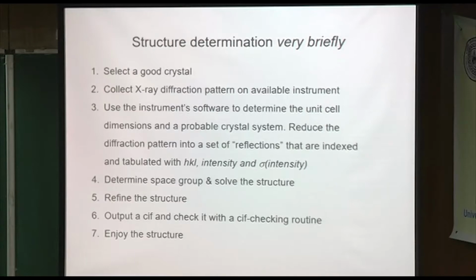And this is where your friendly crystallographer may be a big help to you, especially when you go to check the CIF. Now, checking the CIF also is disappointing in a way, because there's always complaints called alerts about things that you did. Sometimes you can explain them away. And in fact, I think maybe only 1% of the time have I written a CIF, checked it, and had the response, "Congratulations, your CIF is perfect." But I was an editor for Acta Crystallographica for 12 years, so I've really done a lot with CIFs, and I can help people very easily.